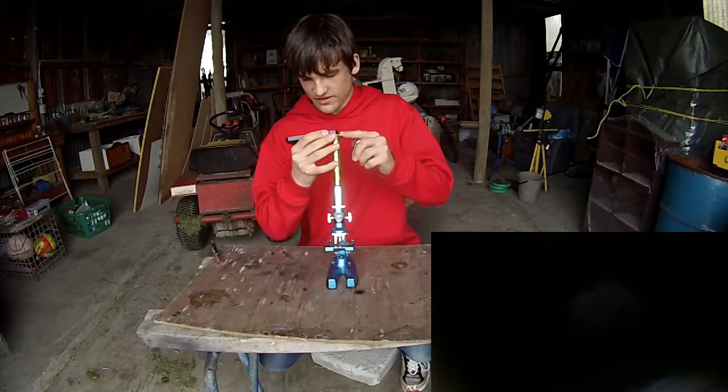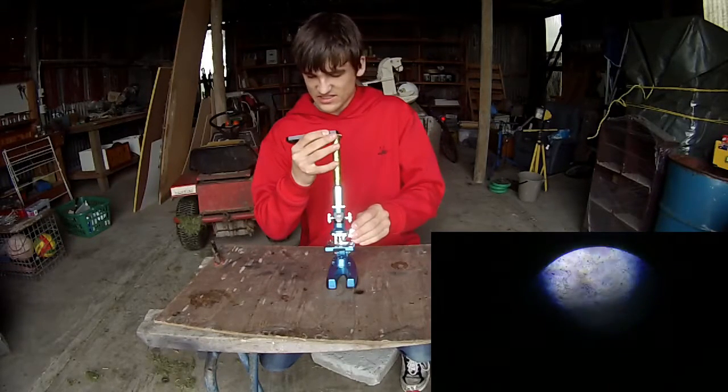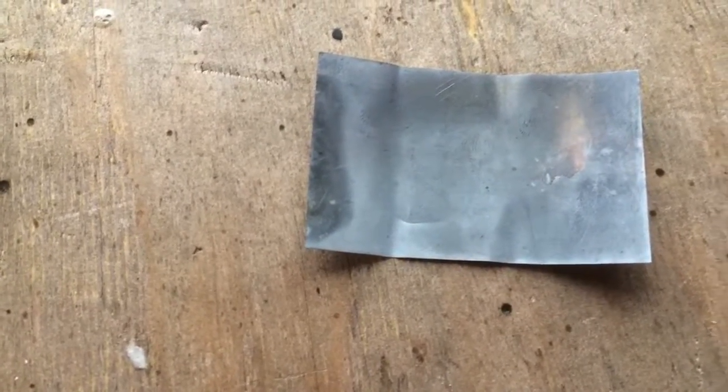So that right there is what you get without the torch. If I shine the torch on it, it's really difficult to see the image. But basically it looks to be almost like orange splotches — that is the copper, and the other grey sort of colour is the zinc. So you can tell right there that the coating I gave was not the best that it could be, because of the spaces and the gaps that are hard to see just by itself. But with a microscope you can see all of them there. And now I'll take a look at the non-coated side here.